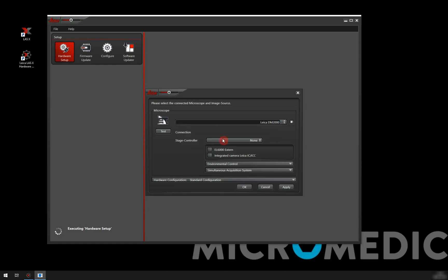That's an upright manual microscope. I will use this one, but the process of configuring this is going to be the same no matter which manual microscope from Leica you have.